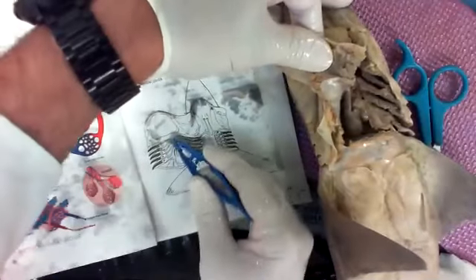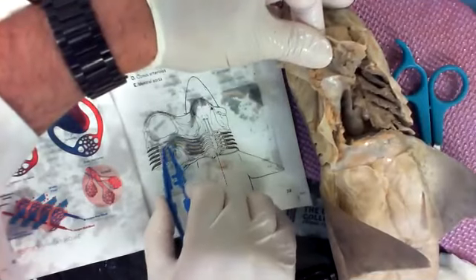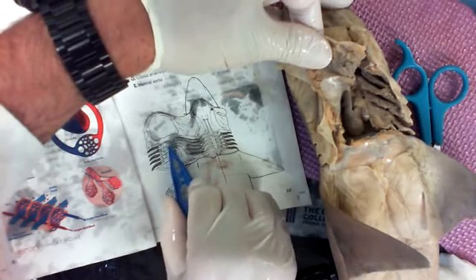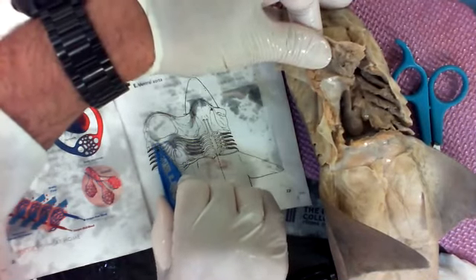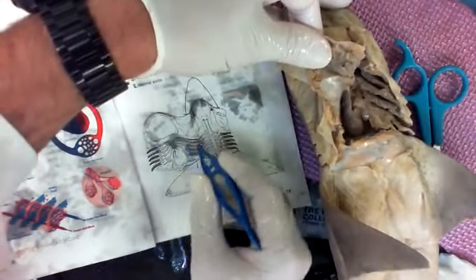Blue in a picture, so it's oxygen poor. It splits off into all these little branches, and we call them the afferent branchial arteries. So they're branching. Afferent is telling you they're going at a special organ. So A for afferent goes at the organ, and the organ is the gills. You have to kind of think three-dimensionally. Actually, we'll go over here.